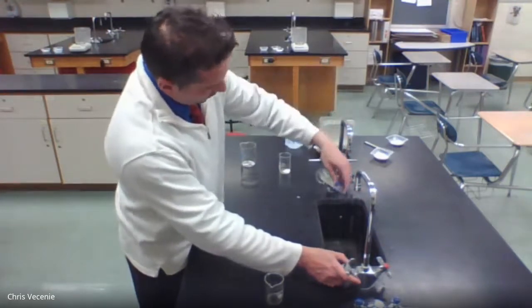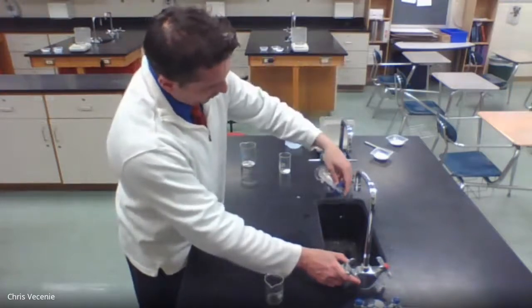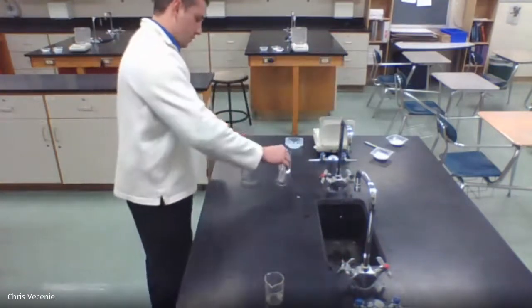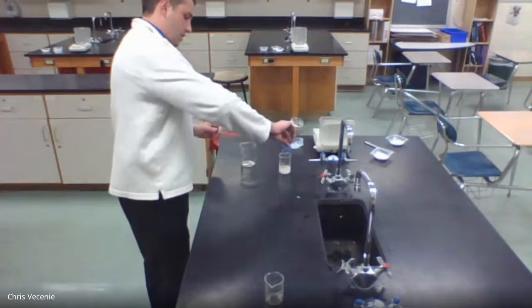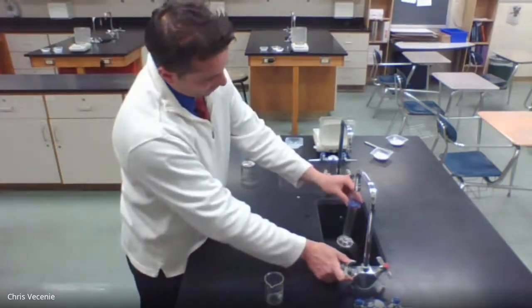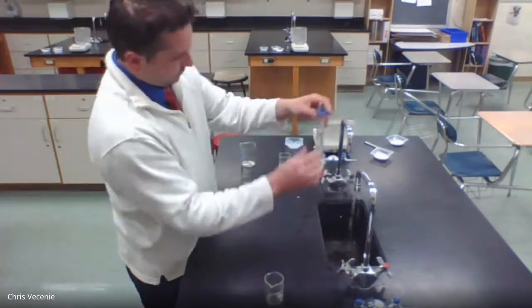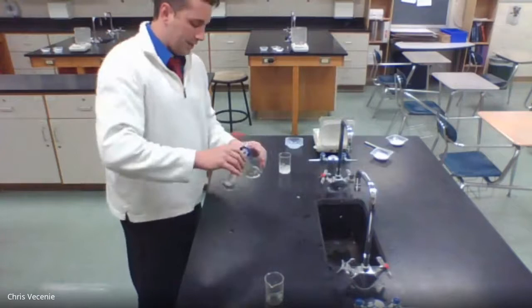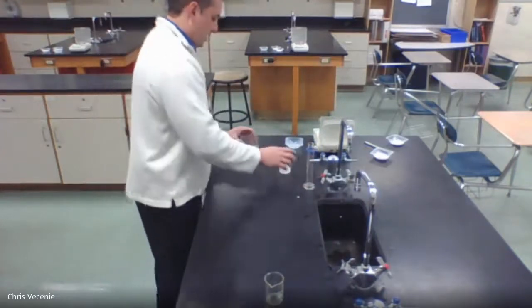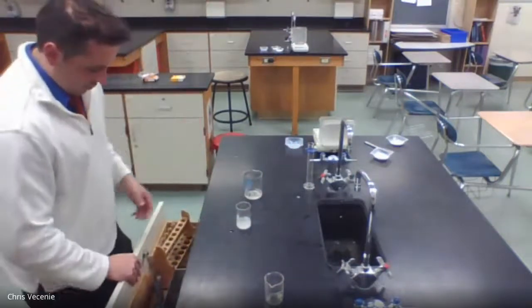And the amount of water doesn't really matter because we're just dissolving it. But the more water that you use, the more you're going to have to filter off when we get to the point that we're filtering. So I could really dissolve it in an immense amount of water, and it doesn't really affect the outcome too much, other than it's going to take me forever to filter.